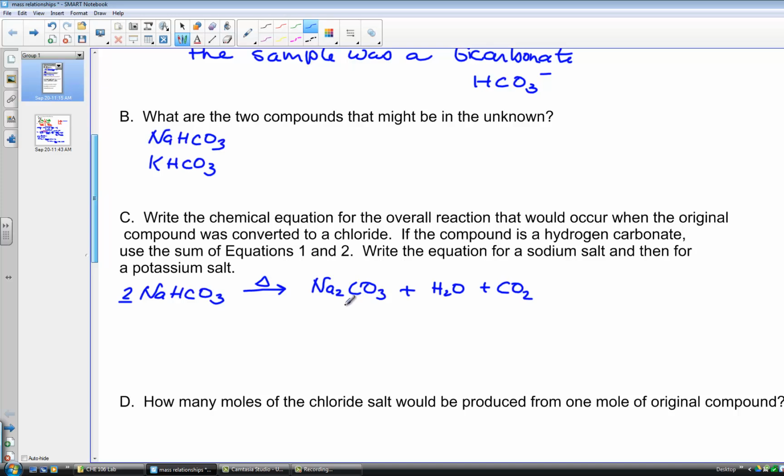Then this product becomes the reactant of the next step. We're now starting with Na2CO3, and we add the acid, about 25 to 30 drops, slowly to a cooled sample. And we realize that we got NaCl and water and carbon dioxide upon the decomposition of the carbonic acid.